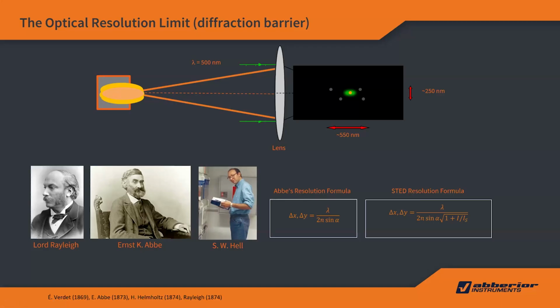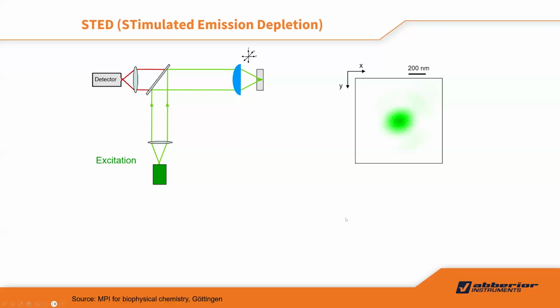What does that mean? It means that STED microscopy is intrinsically an optically perfect confocal microscopy. Otherwise, if the optical part is not good, it compromises the resolution performance. So remember, any STED microscopy is an optically perfect confocal microscopy intrinsically already. Then the super resolution part is coming from the dye. That's why it's a Nobel Prize in chemistry. If the dye can handle a lot of STED power, it can improve the resolution. That's the STED effect I'm going to explain to you in this slide.